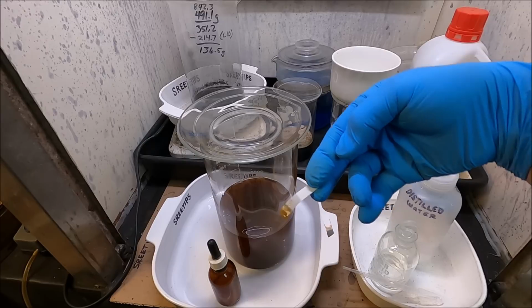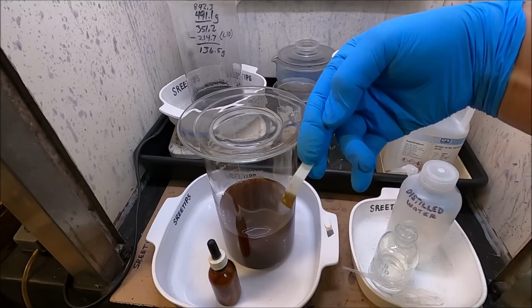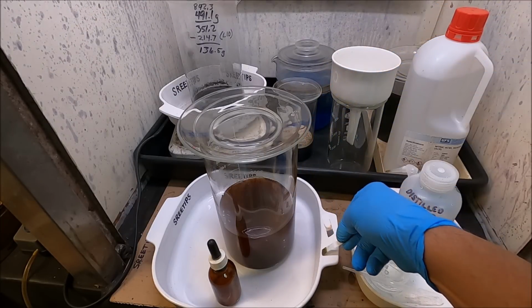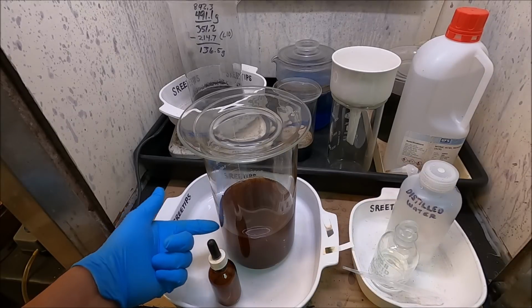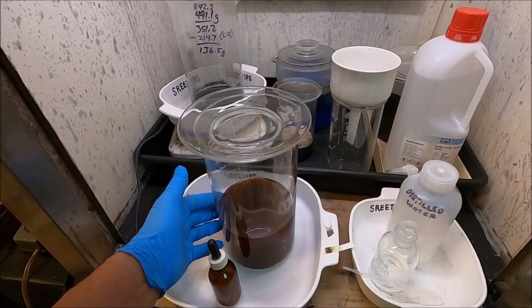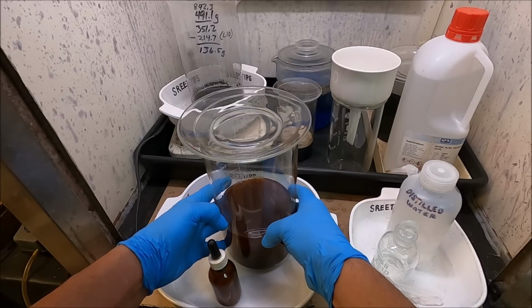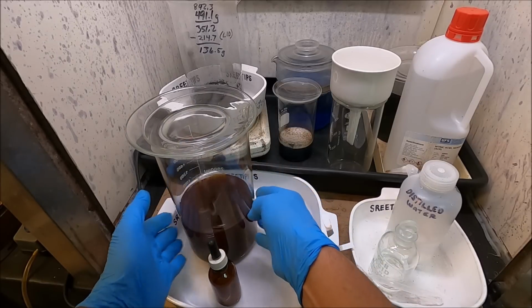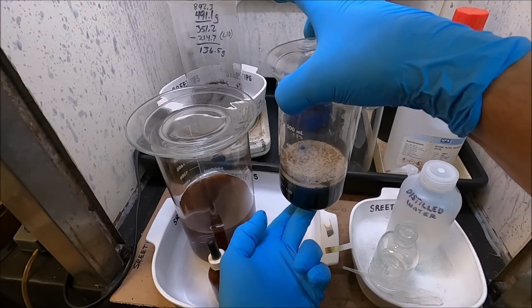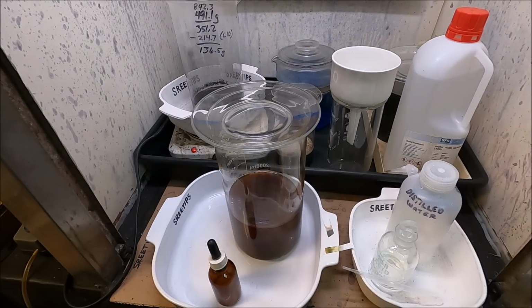And that looks like what we got, man. It's green and orange. It's green and orange. That means platinum and palladium in solution. No more dark brown. So we've got all the gold dropped out of here now. What I'm going to do is filter the gold out of here, and then we'll process the platinum and palladium solution and join it with this palladium solution and go from there. But for now, let's look at this back here.